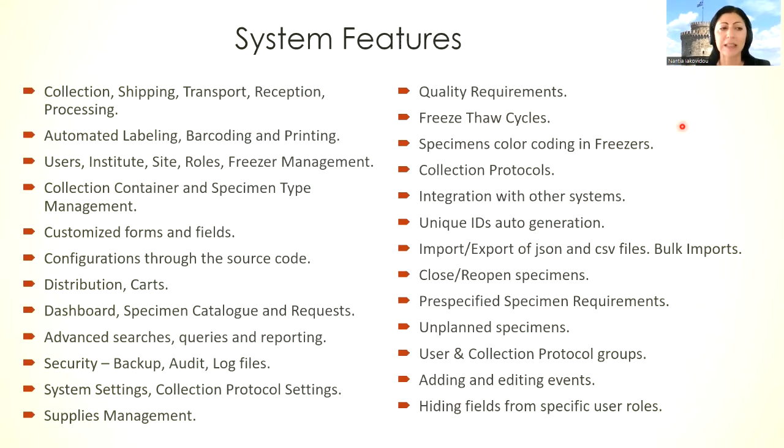If I had to highlight a couple of these implementations, I would definitely highlight the achievement of automated labeling, barcoding, and printing. In the biobank, we print labels for every single specimen. Imagine that before the BIMS, the users had to manually prepare every single label and also to manually print all the labels, which you can imagine how time-consuming and tiring a task it was. This was also achieved by using an additional labeling software tool, which was set up in parallel with OpenSpecimen, and they now work in tandem.